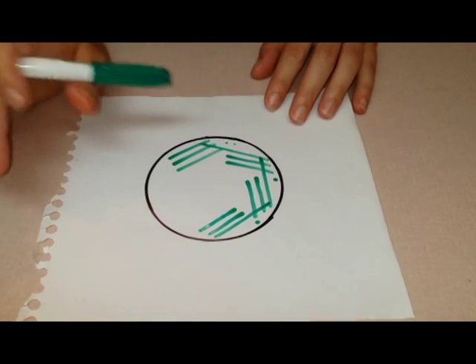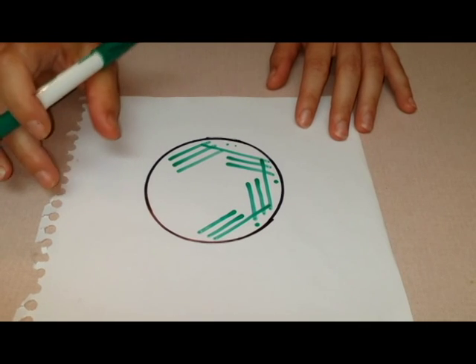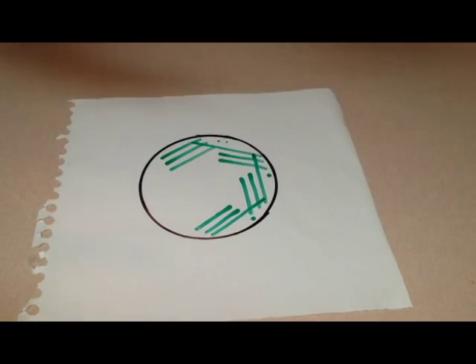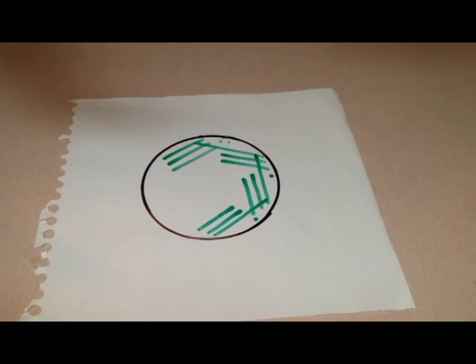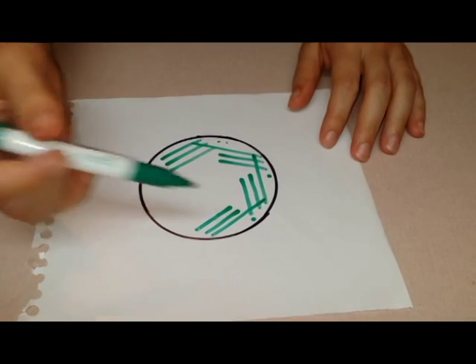And you will definitely get single colonies, these individual little circles coming from one cell clone with this method.